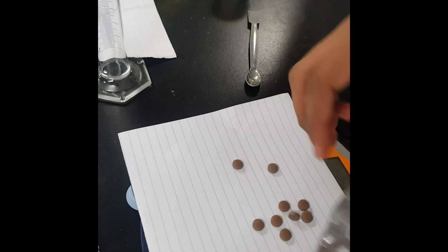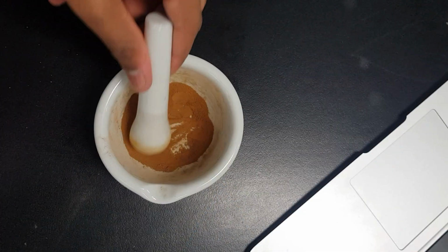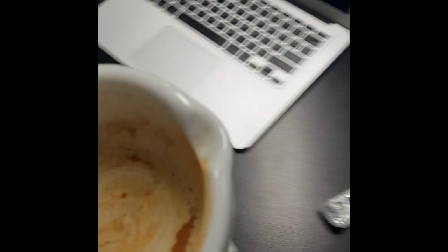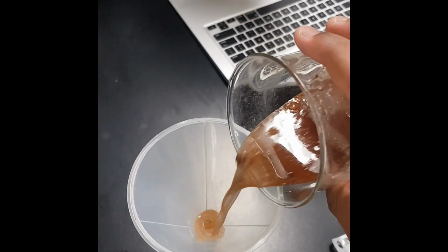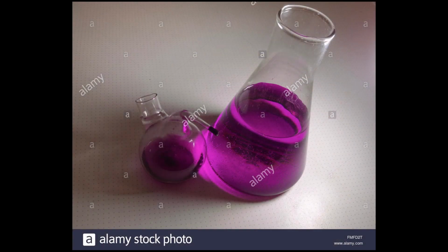Now that we have all of that out of the way, we can start by preparing the iron that we will titrate. For this, we need to weigh out 10 tablets on a scale and note down the weight in our logbook. We then proceed to crush up the tablets using a mortar and pestle till they become a fine powder. Empty the contents of the mortar and pestle into a beaker and rinse out the mortar with the sulfuric acid. Mix the solution and then pour into a volumetric flask using a funnel and fill up to the mark. Shake the flask around and leave it to sit for approximately 2 hours so the sulfuric acid can break the tablet down completely.